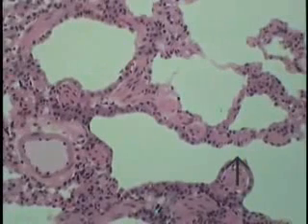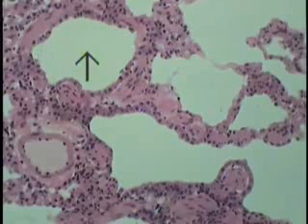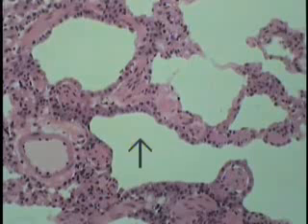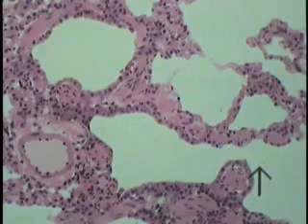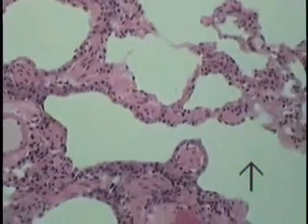It's a transitionary portion, a very short segment, known as the respiratory bronchiole. And so this tube, angled perhaps either above or below the field, entered here and then is going in the direction of the arrow. That is the position of the lumen of this particular tubule.